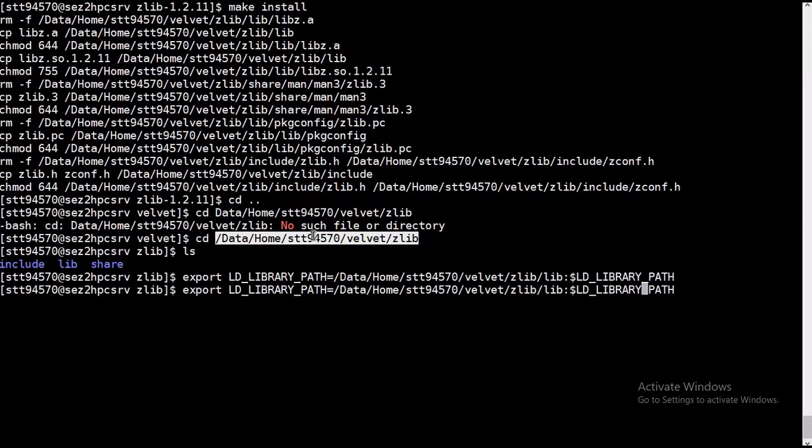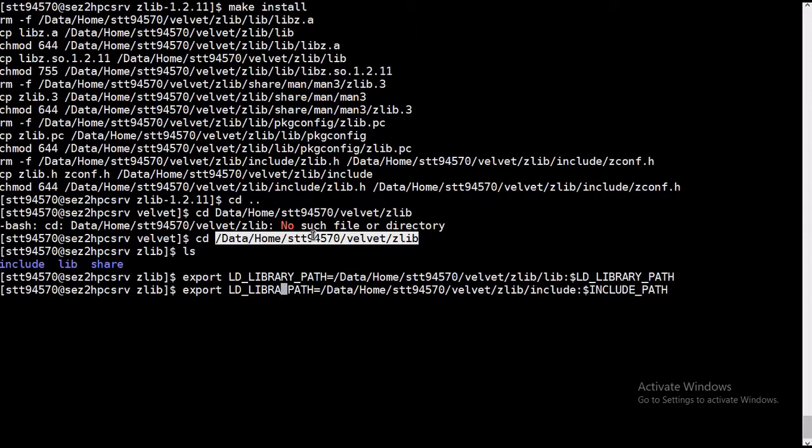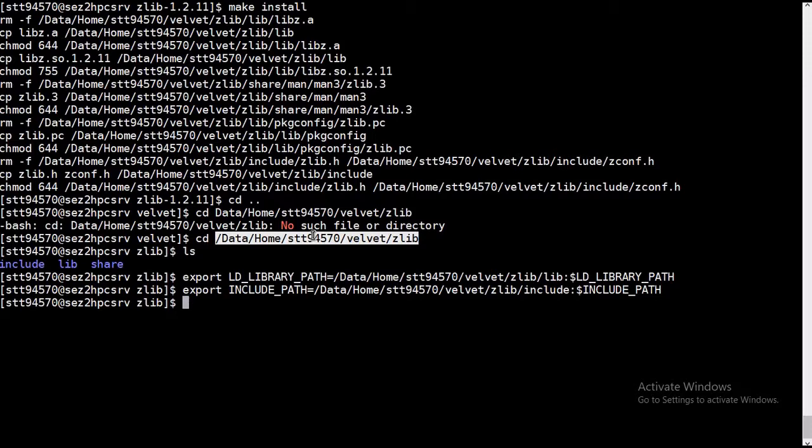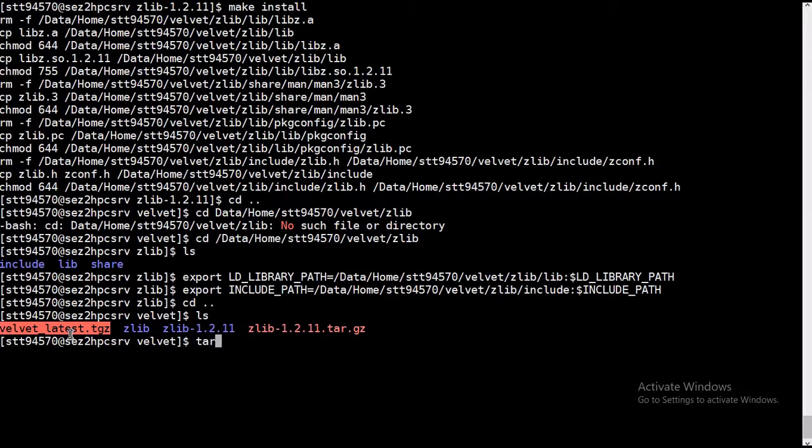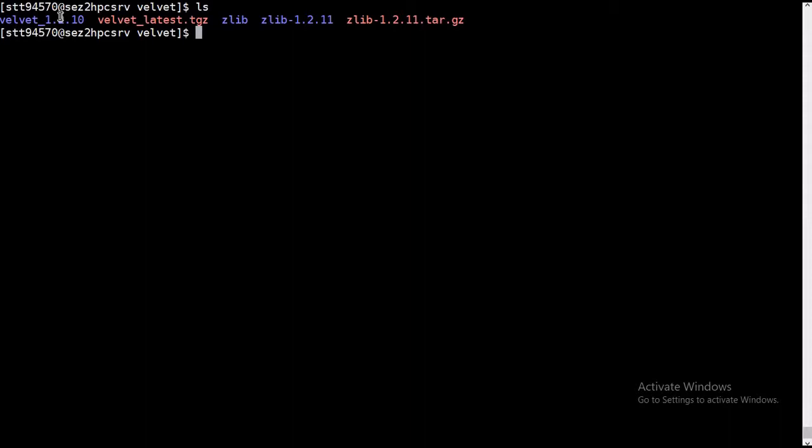So we are good to go for installation of velvet. We have to enter this velvet. Also it's untarred. Let's check what is the directory, and this is the latest version currently present.